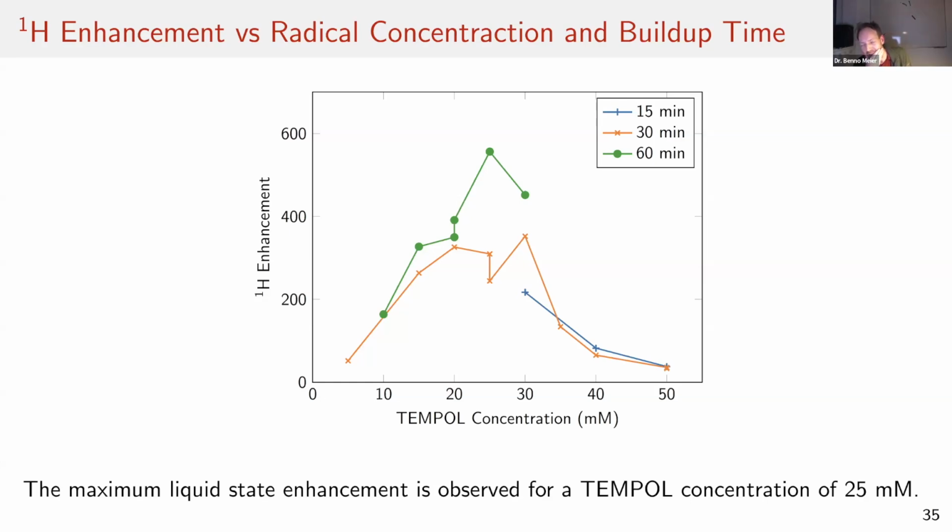Well, I don't know. What I will say is that in my view, the cost of the instrumentation is maybe not so relevant. If you really think of clinical application, then whether your DNP system costs 500,000 euros or your parahydrogen system costs 50,000 euros, that is on the cheap side.